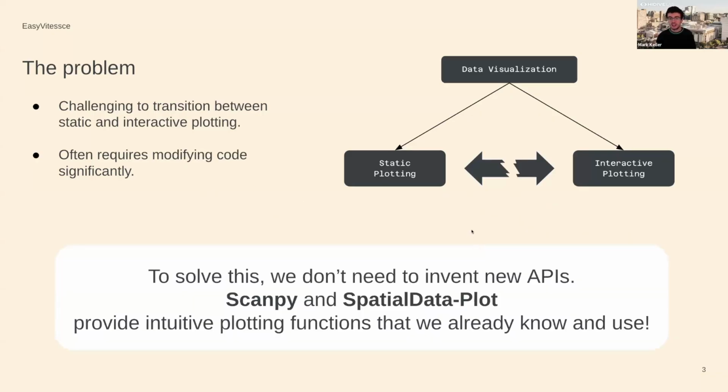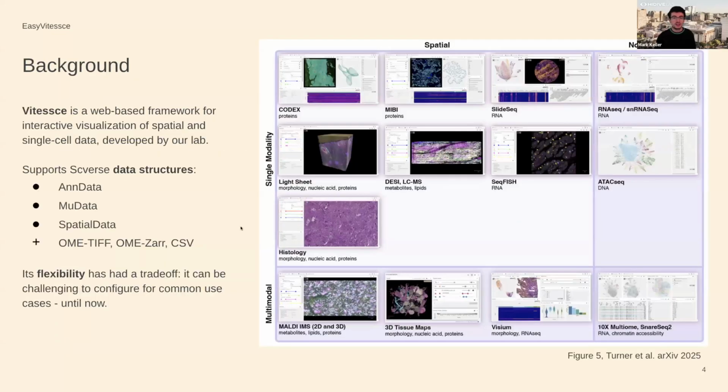But to solve this challenge, we don't need to invent new APIs. The key insight here is that ScanPy and Spatial Data Plot already provide intuitive plotting functions that people are using and know.